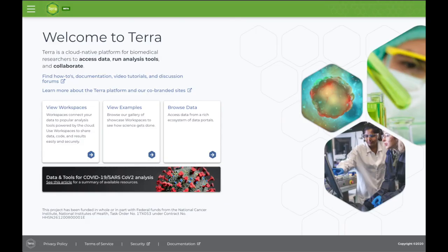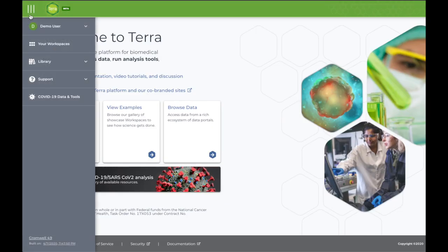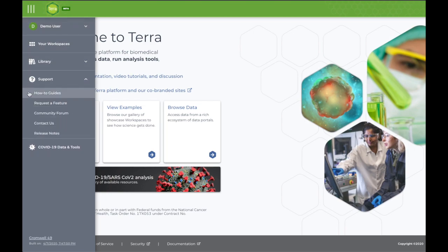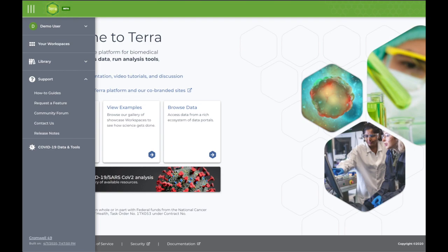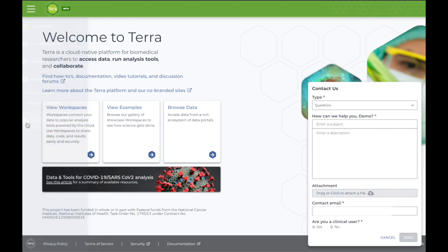If you need help using the site or building your workflows, access the Support menu, which includes links to how-to guides and documentation, resources for you to request a new feature, as well as a link to our Community Forum. If you can't find what you're looking for there, don't hesitate to contact us directly through the link shown here.